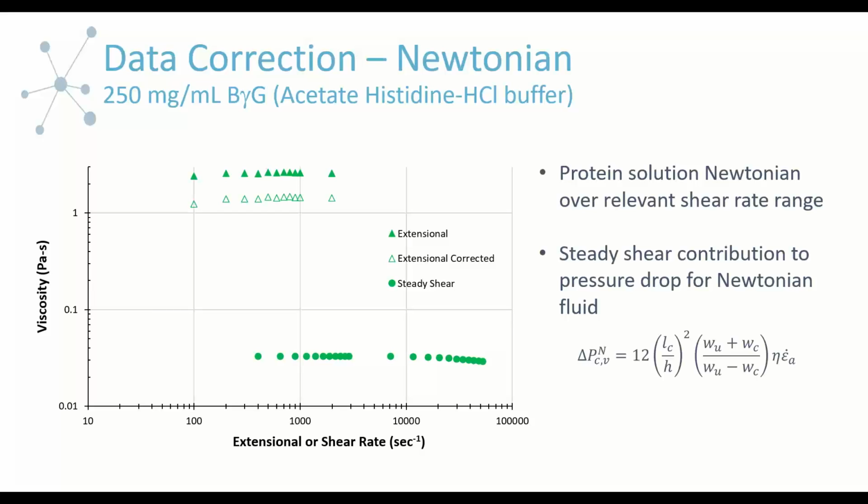The same process can be done for the power law fluid. The expression is a little more complicated, but it still has all the components. It's basically the geometry, but then also the power law index and prefactor that you get from fitting the data.